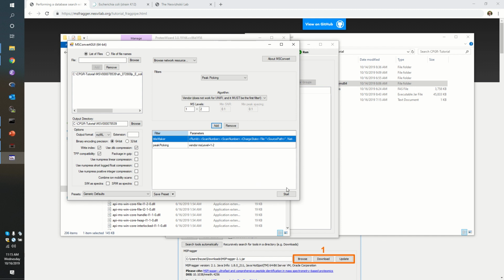At that point, I could click Start, and the software would dutifully read the raw file and write out an mzML file. I would point out that it's often quite a lot easier to just remember the settings you want and create a batch file to run it on the command line instead, but a lot of people feel much more comfortable in the confines of a graphical user interface, so it's important to have that capability.